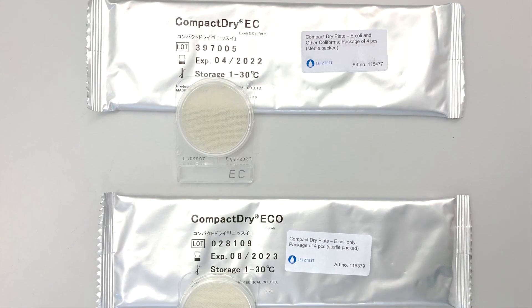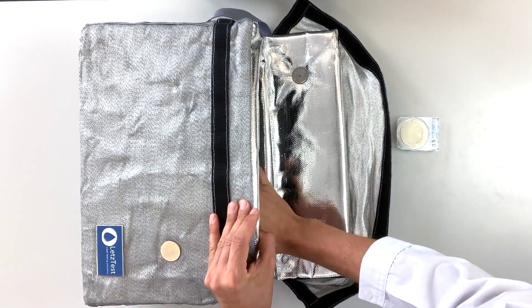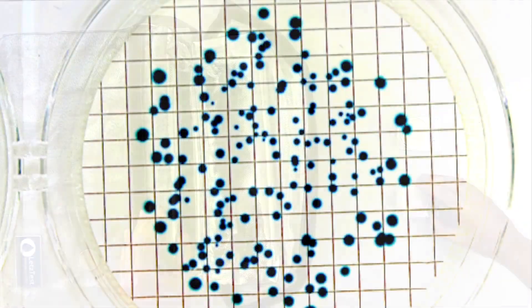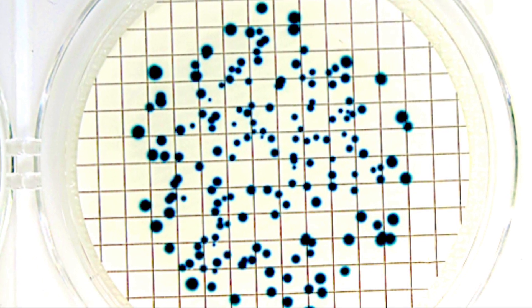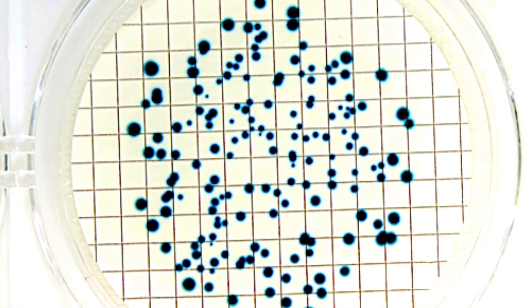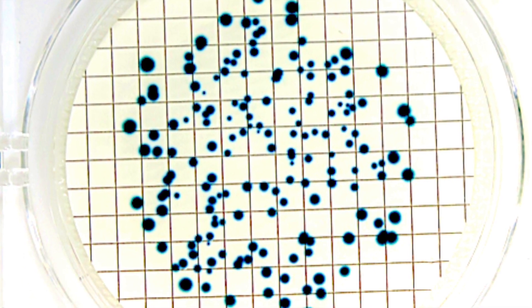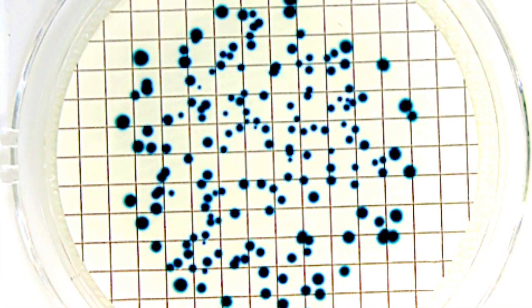If you have used the EC or ECO plate and the water sample was contaminated, then you will now see blue colonies for the fecal indicator bacterium E. coli. These blue colonies should be counted regardless of their size.